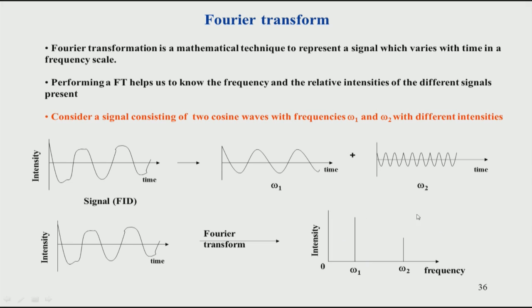So, this is how a spectrum is recorded. Basically, you record a time domain FID, and the FID is automatically combined, because that is how the whole signal will be detected. Upon Fourier transformation, which is typically done by the computer automatically, that will give you a spectrum.